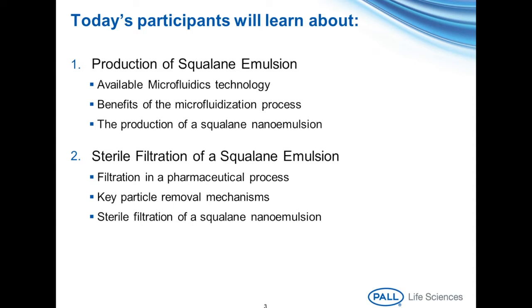Participants will also learn about the sterile filtration process of the Squalane nanoemulsion. During this discussion, we will talk about filtration in a pharmaceutical process, key particle removal mechanisms, and how to sterile filter the Squalane nanoemulsion that is created with the microfluidizer.